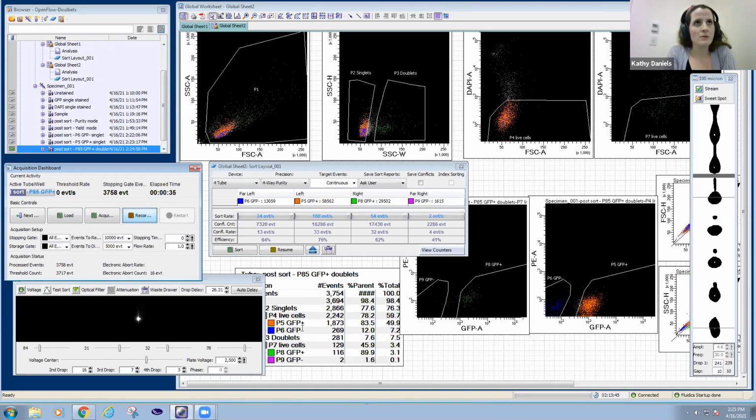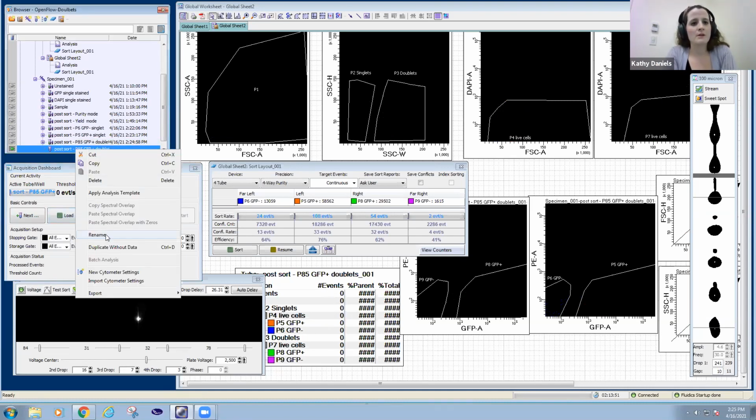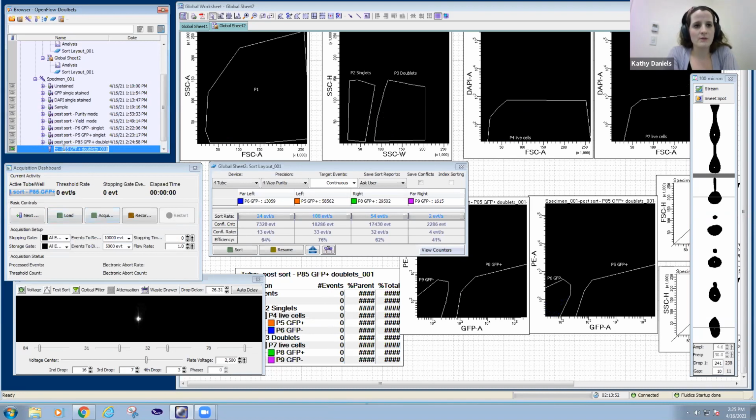So Rui, maybe as you're putting on that last sample and recording that, I'll ask a question that came through. With the example with the dead cells, would you factor the dead cells into the percent purity calculation? Because you're measuring RNA, they are still there.